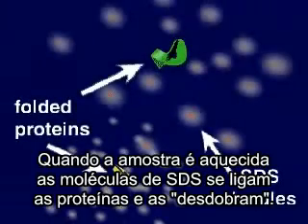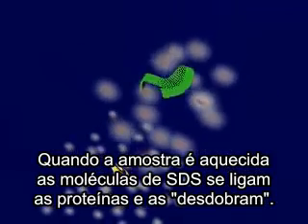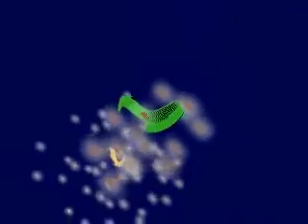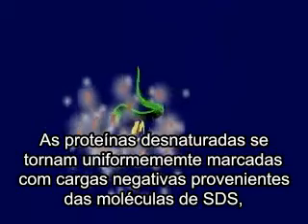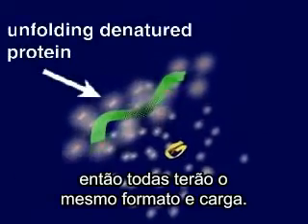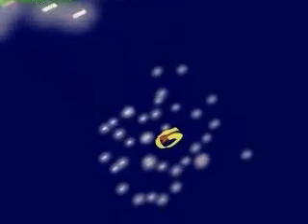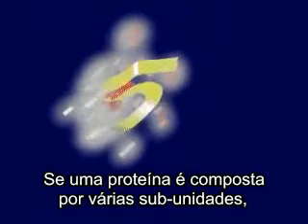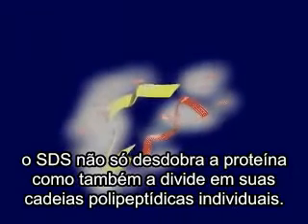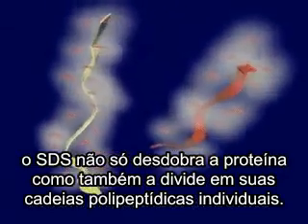When the sample is heated, the SDS molecules bind to the proteins and cause them to unfold. The denatured proteins become uniformly coated with negatively charged SDS molecules, so they all have a similar shape and charge to mass ratio. If a protein is composed of several subunits, the SDS not only unfolds the protein, but also dissociates the protein into its individual polypeptide chains.